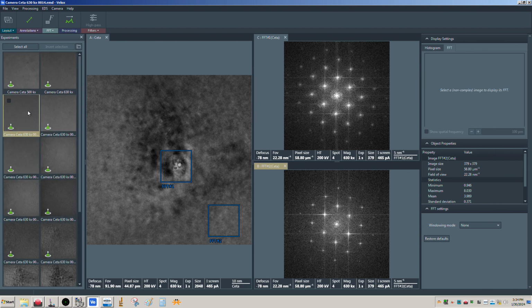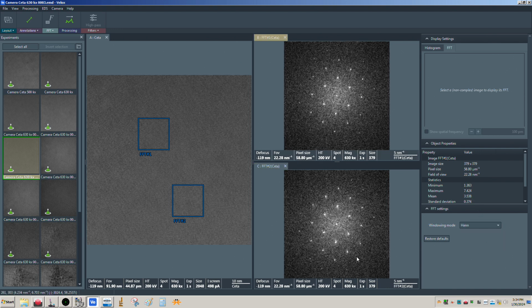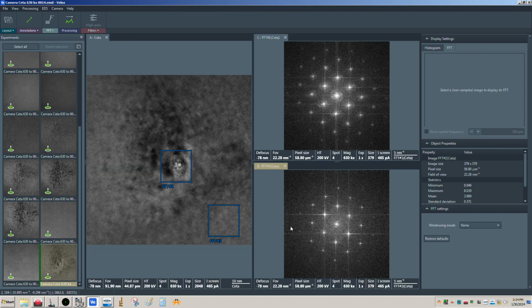Okay. So the disorder can be seen in multiple ways, right? You can see how tight the spots are here. Again, if we apply the windowing to them, yeah. So I mean, it looks pretty dramatic here. I'd say this is even better. This was better than what we were getting. Yeah, so I think even here you can see, even away from the main part of the damage, right? We're still seeing a little bit of the blurring of the spots there.